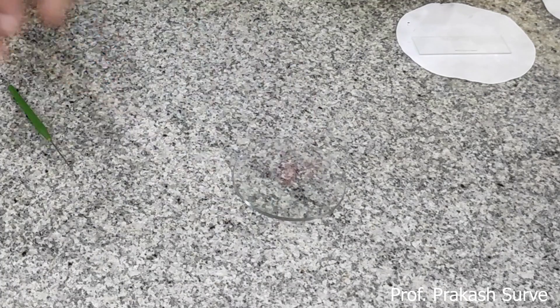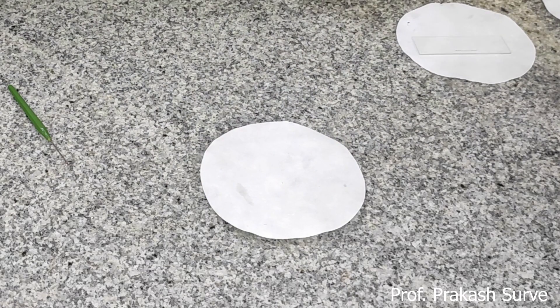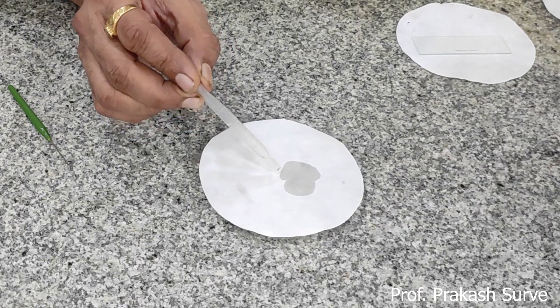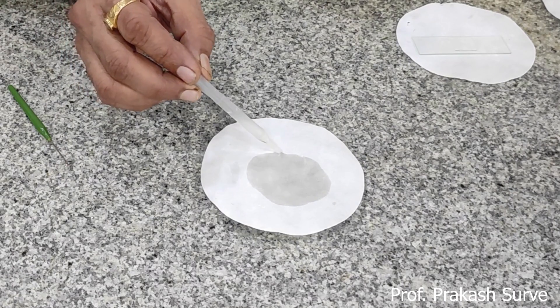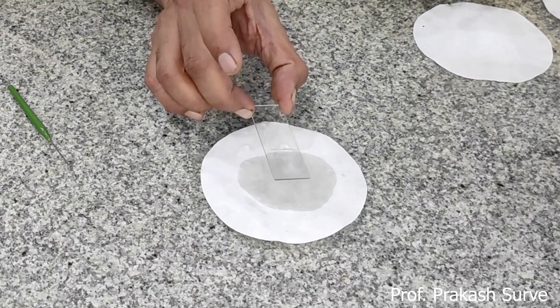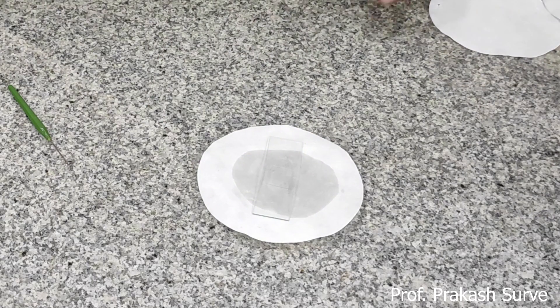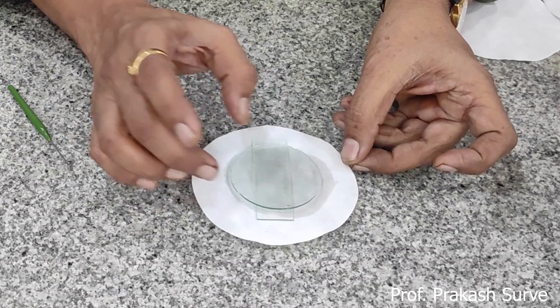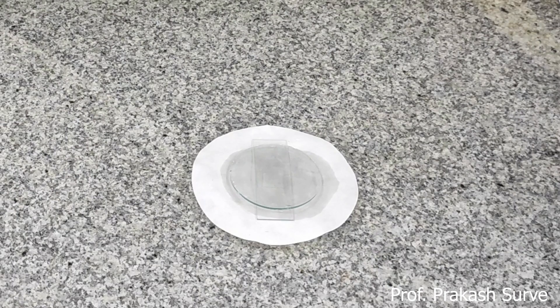Pollen grains need humidity for germination. Take another watch glass, keep filter paper on it, and drop water on it so that we can create humidity — 90% humidity is required to get good growth of the pollen tube. Keep the slide on this wet filter paper, then put another watch glass on top so that it gets proper temperature and humidity. Keep this aside for at least 30 to 40 minutes.